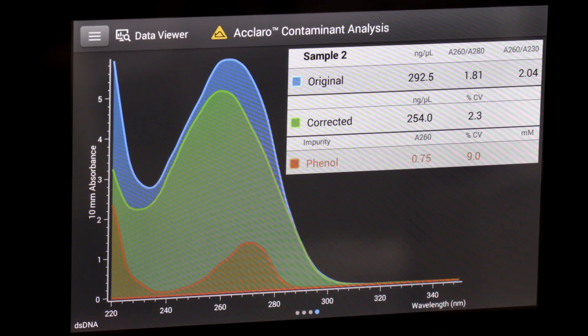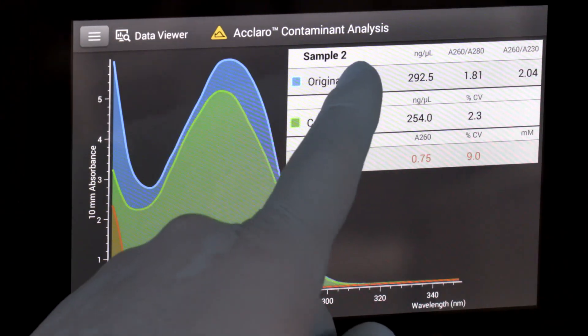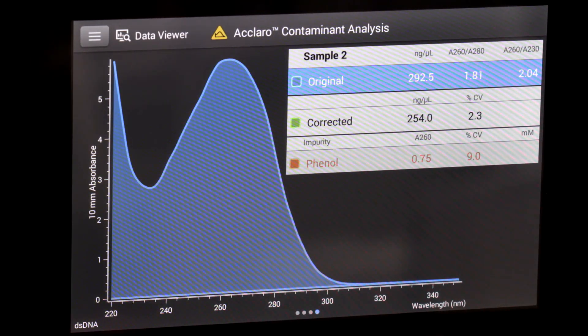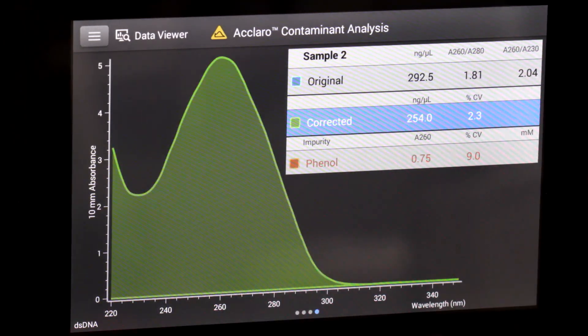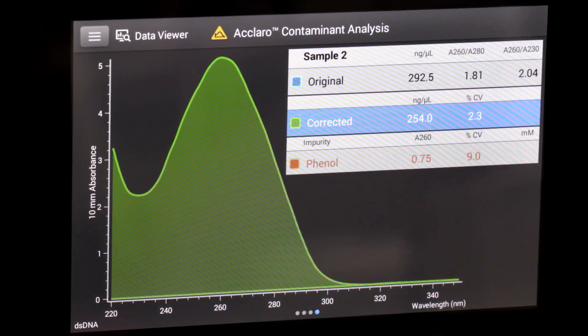On any other UV-Vis instrument, the presence of phenol in your sample would cause an overestimation of the DNA concentration, not with the NanoDrop One instrument. The goal of the Acclaro technology is to provide a true sense of how much DNA is in your sample so you use the correct amount the first time.